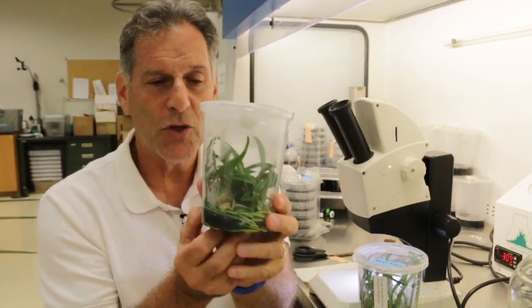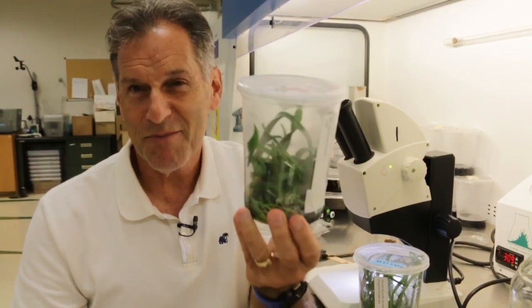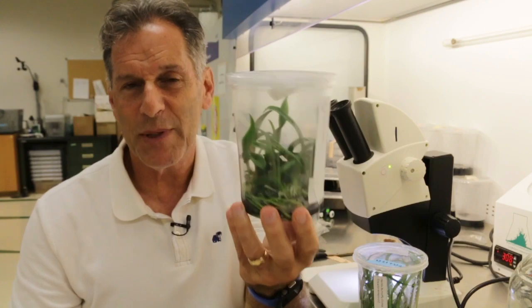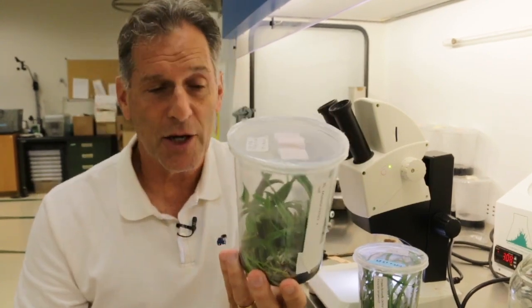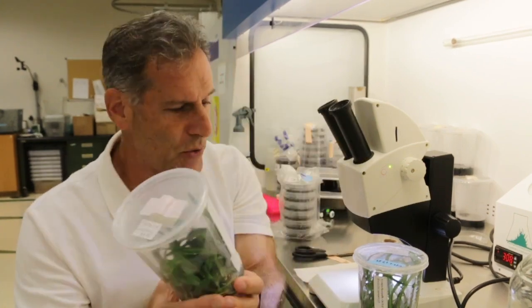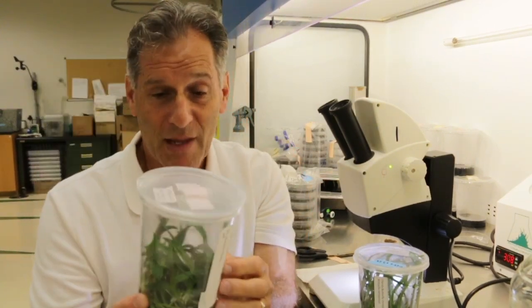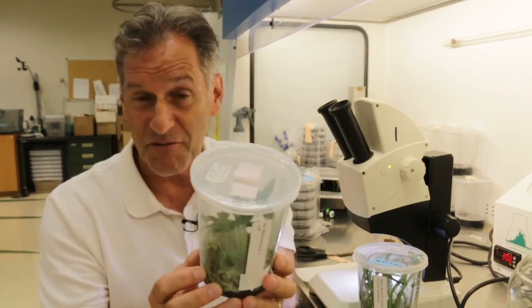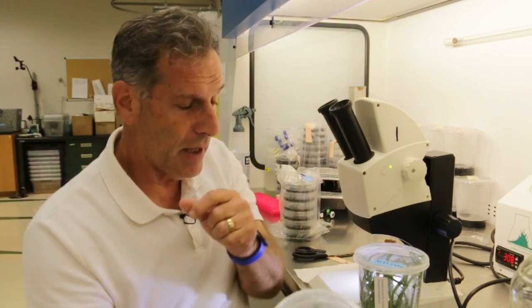They're not hitting the top of the containers yet, but this was only transferred in here a little over two months ago. So there's still a little bit of time before they'll hit. They were big when they got put in here, but they'll hit the top of the containers pretty soon. Again, the idea is you get bigger plants in culture, in vitro, and they get a jump on their life.